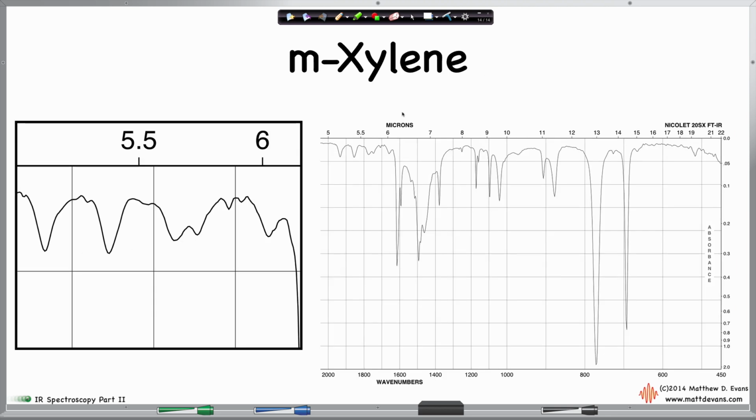All right, so this is called metaxylene. Let me show you the structure of this one now. I'm going to face forward so I can get this as a decently drawn structure. So benzene. Here's xylene. Xylene has a CH3 and it's meta-substituted, which means that the next CH3 is 2 carbons over. And so this is considered a 1,3 disubstituted compound.